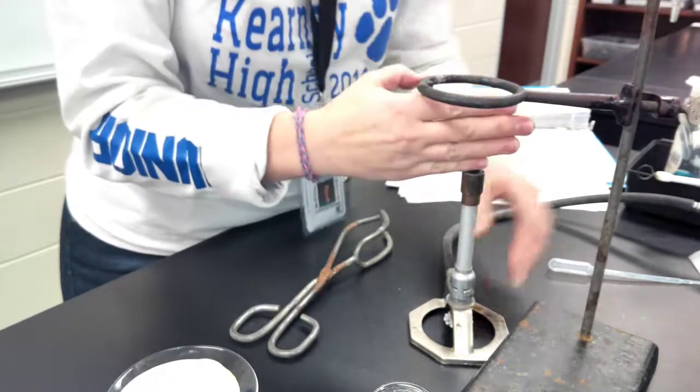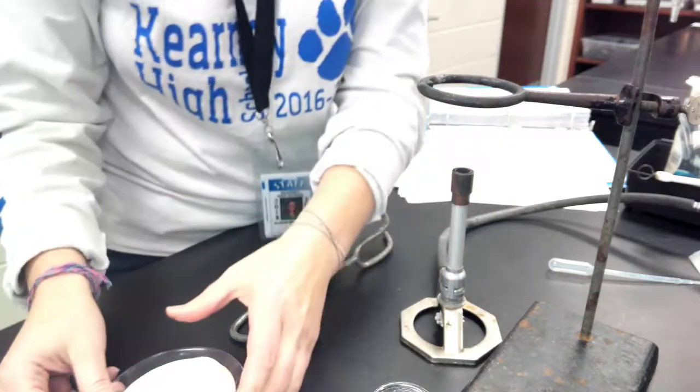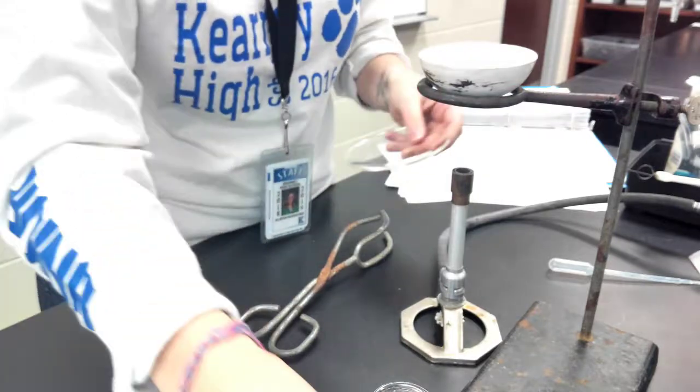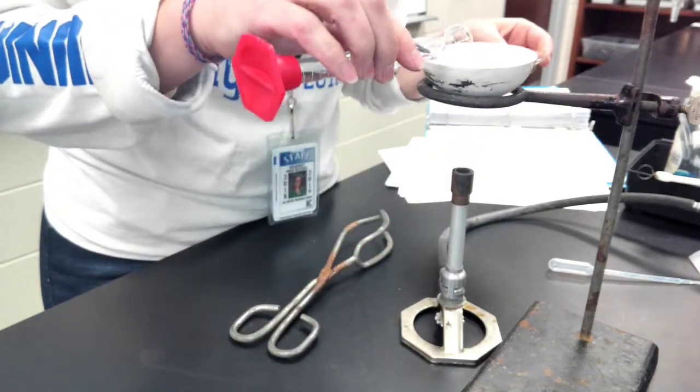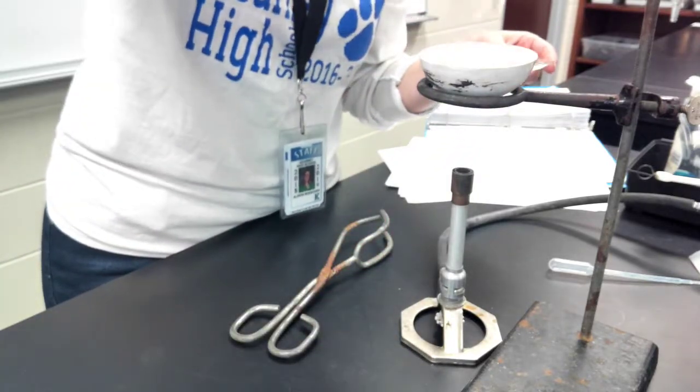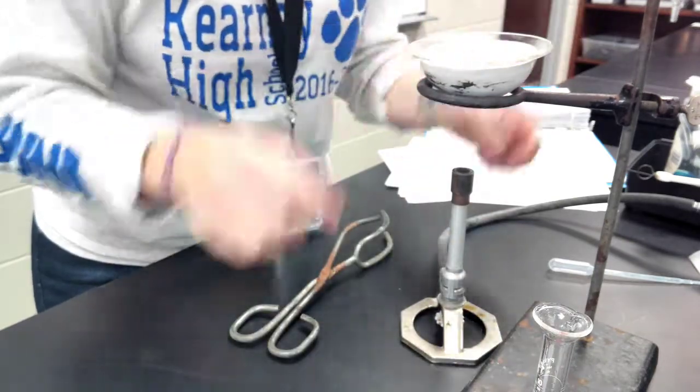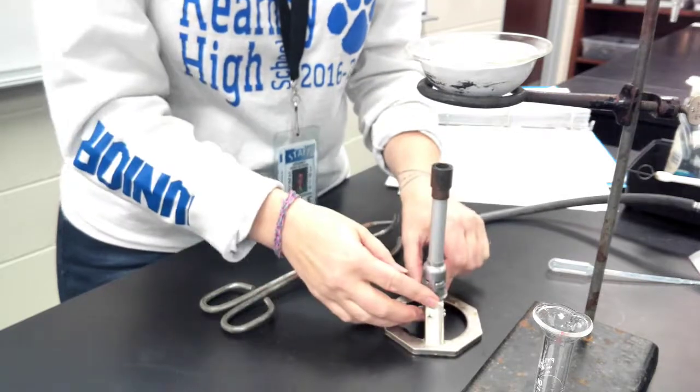Grab matches or lighters from the back counter. And then I place my evaporating dish on. I transfer my solution into my evaporating dish. I cover with my watch glass. I light. I place it underneath.